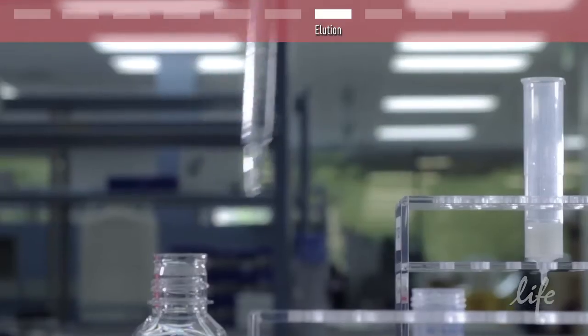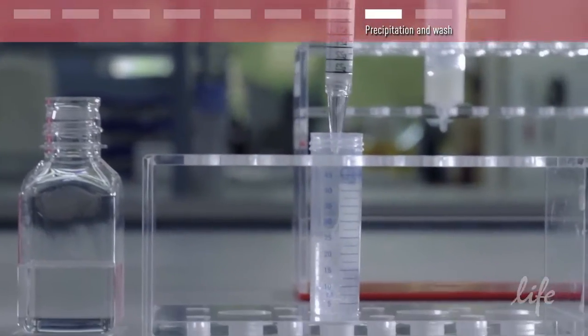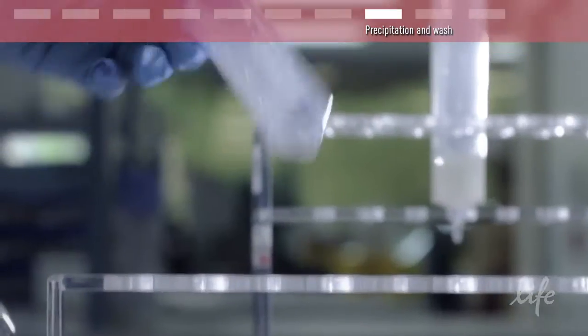Now that we have the eluate, add isopropanol to precipitate the plasmid DNA. Mix and centrifuge.